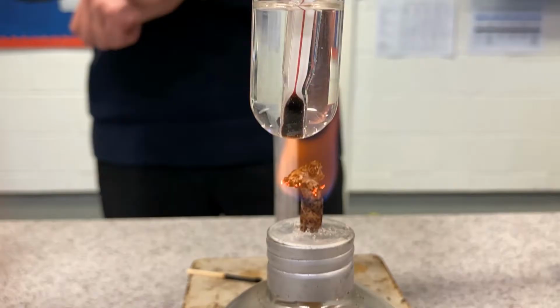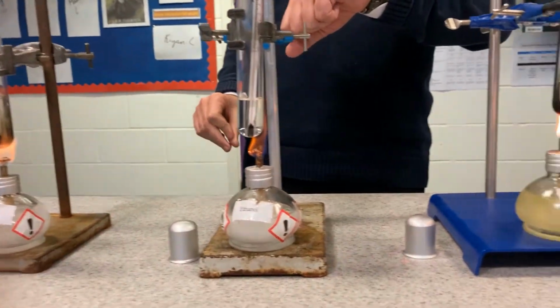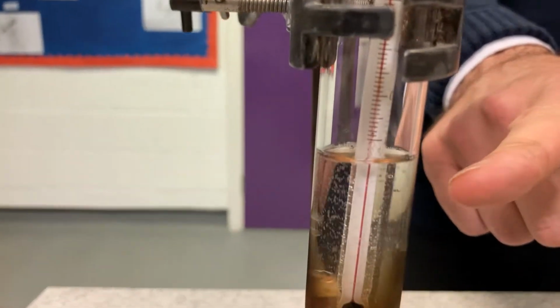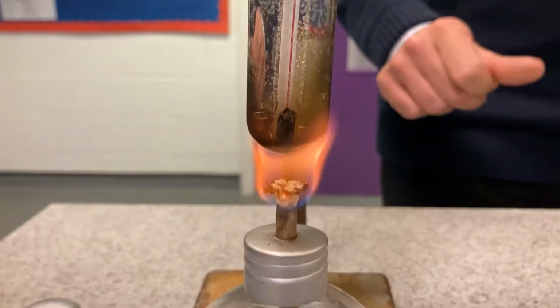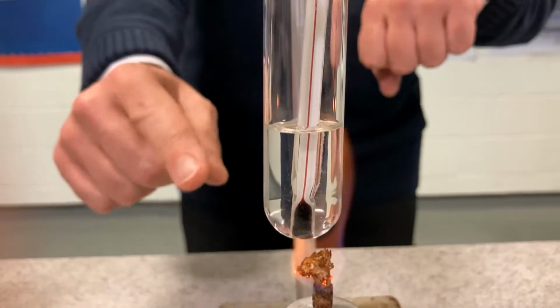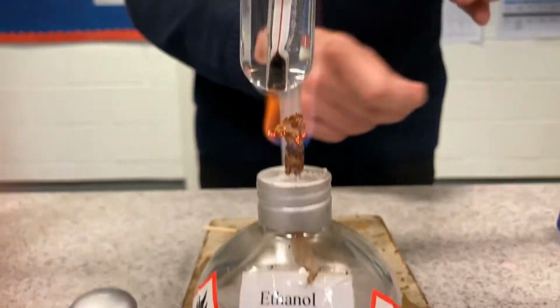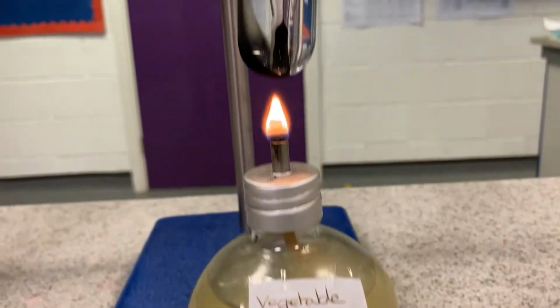Now, it's about 40 seconds, so I'll give it a little bit longer. Now, I can actually see this one's bubbling away. This one is getting very, very hot. It's bubbling. That one did start first, though. And that one's starting to bubble as well. Right, that is coming up to a minute.